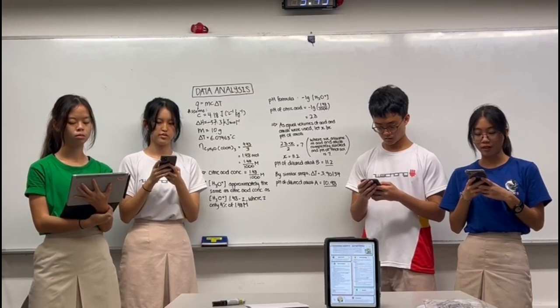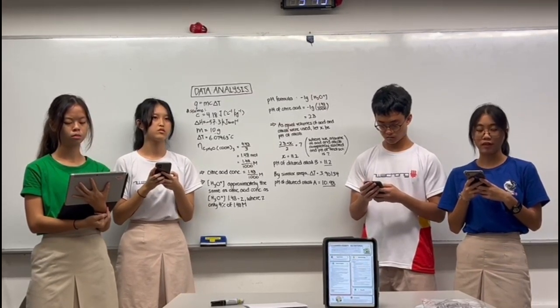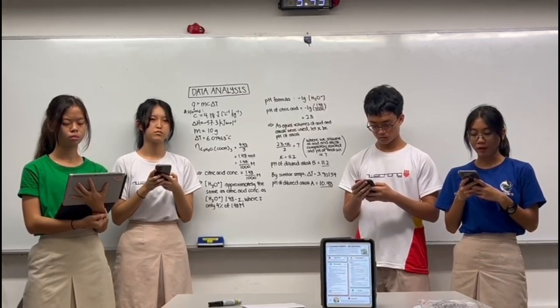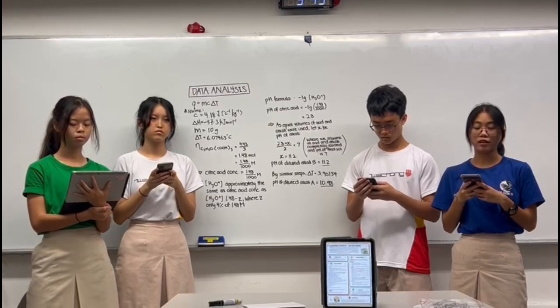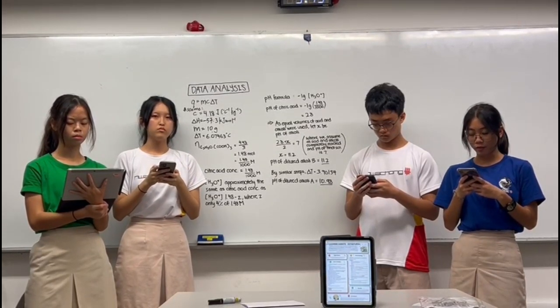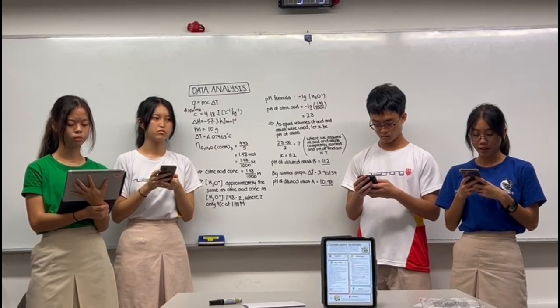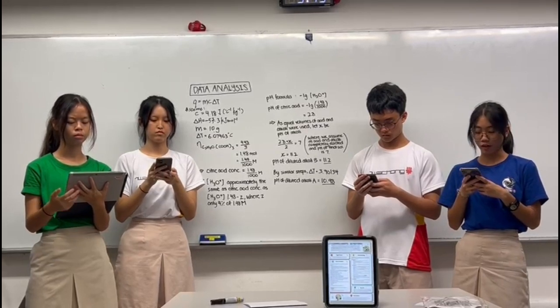Step 1. We diluted equal amounts of Magiclean Dual Power Toilet Cleaner with water, giving us FA1. Step 2. We diluted equal amounts of Agent A with distilled water, which gave us FA2. Step 3. Using a measuring cylinder, we poured FA1 into a styrofoam cup. Step 4. We used the microbit's thermistor to record the initial temperature of FA1.